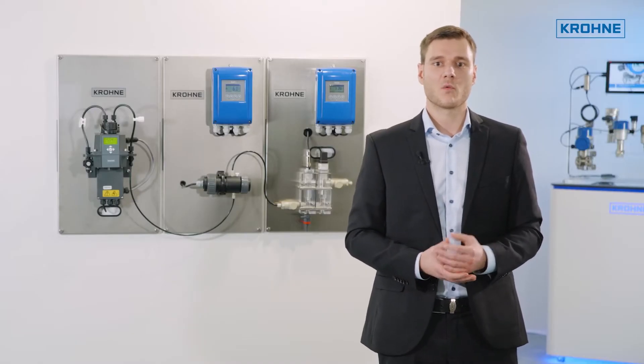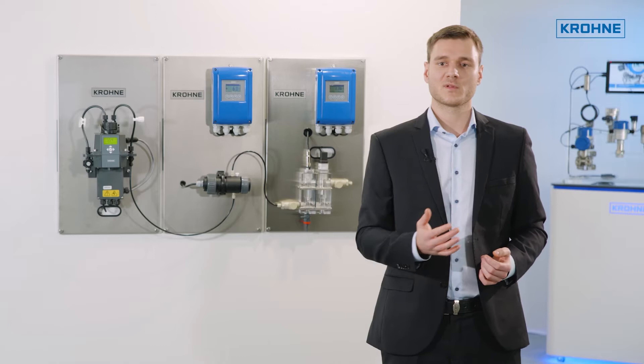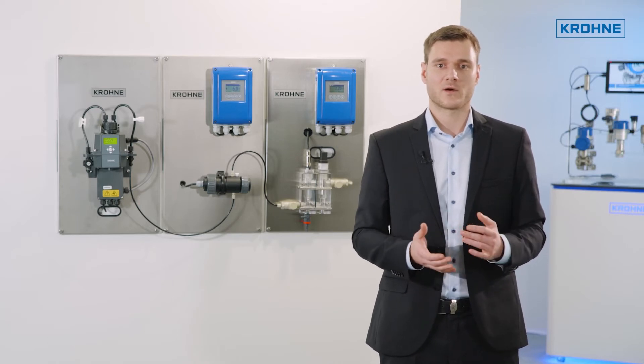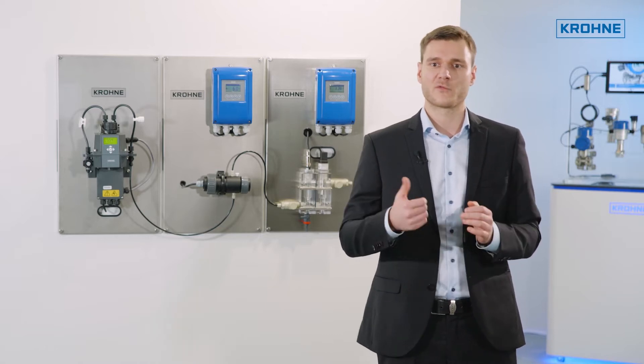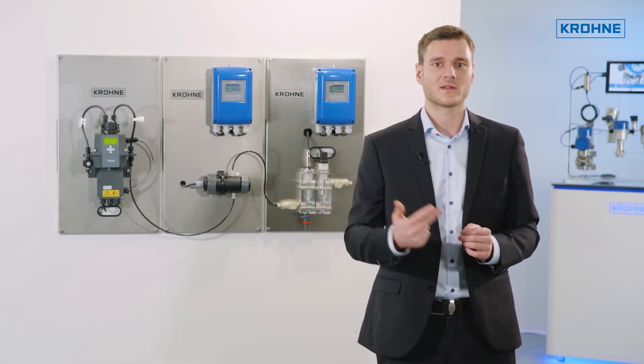You only have to mount the panel on the wall, connect the hoses for the measuring solution, and do the external wiring. KRONE has successfully offered this complete solution over many years for free chlorine, ozone, and chlorine dioxide.